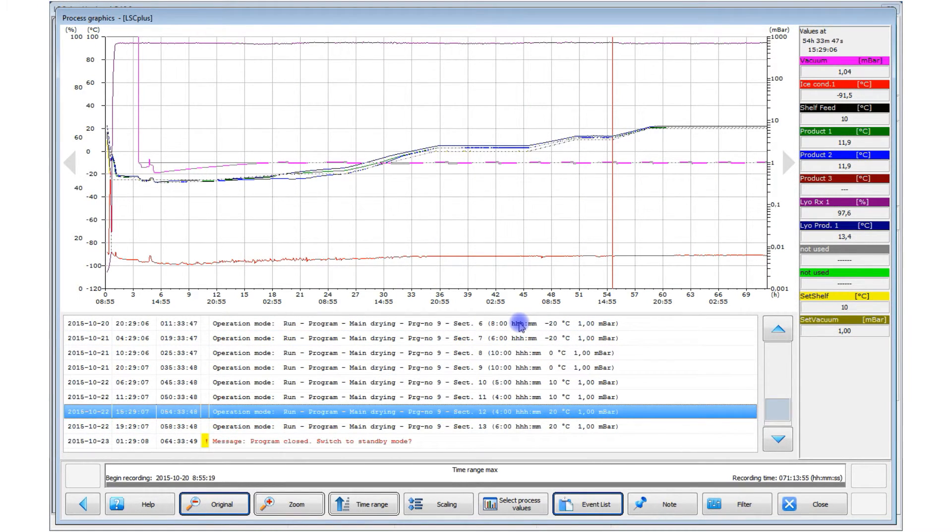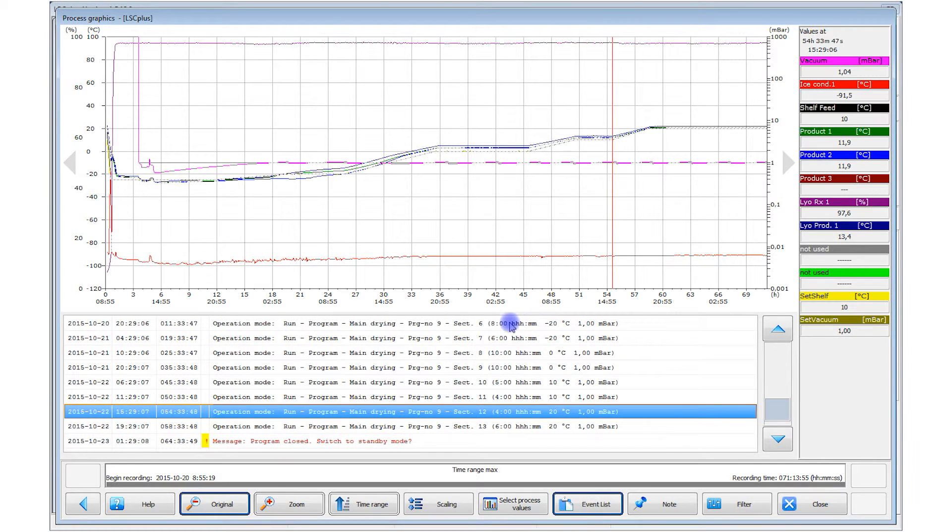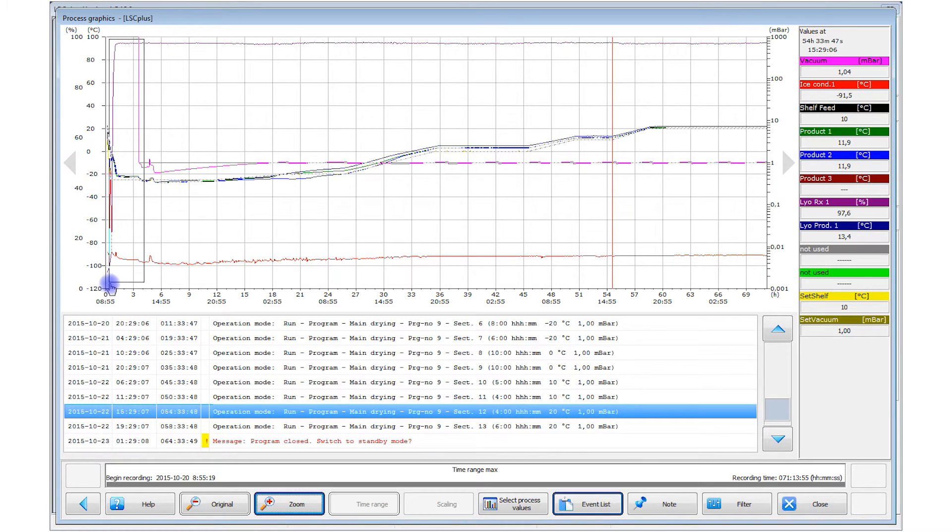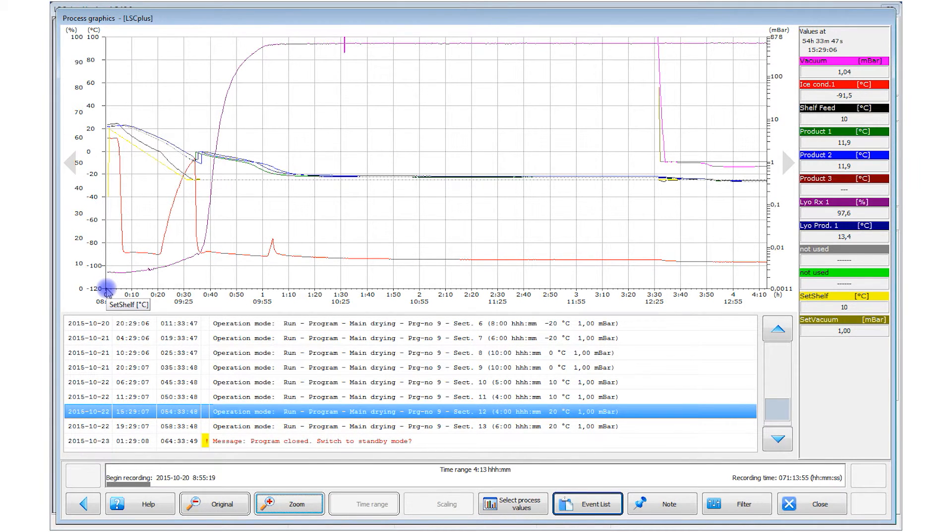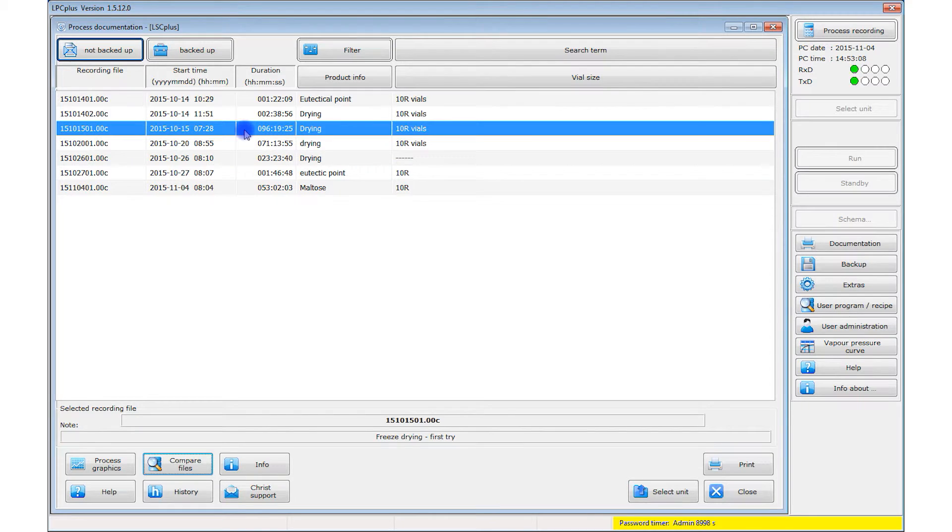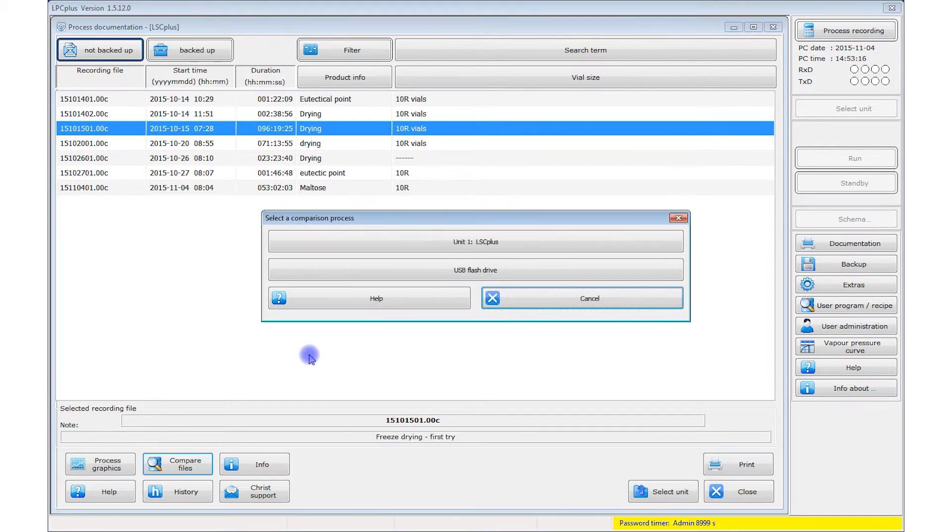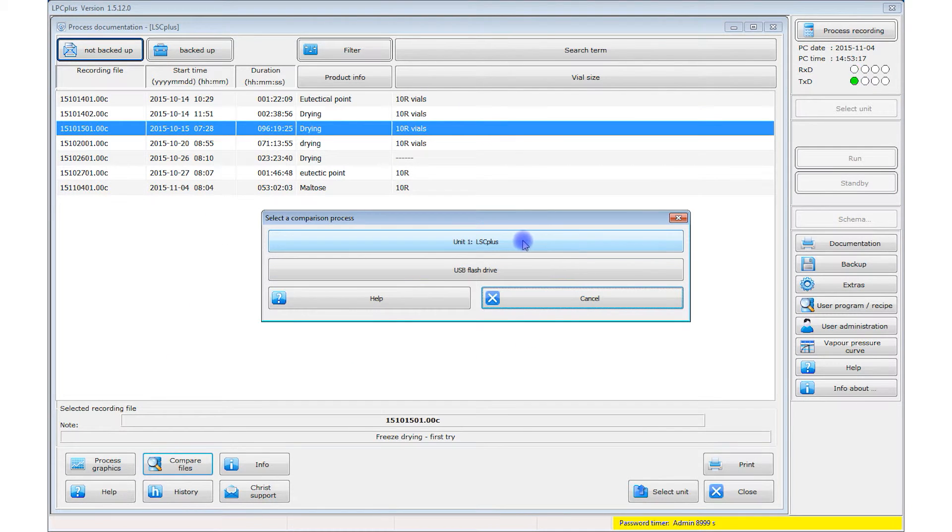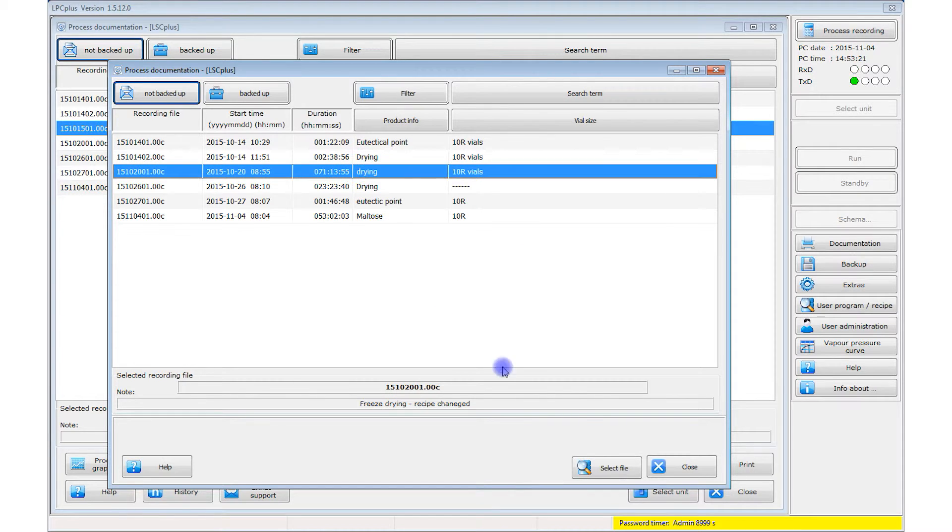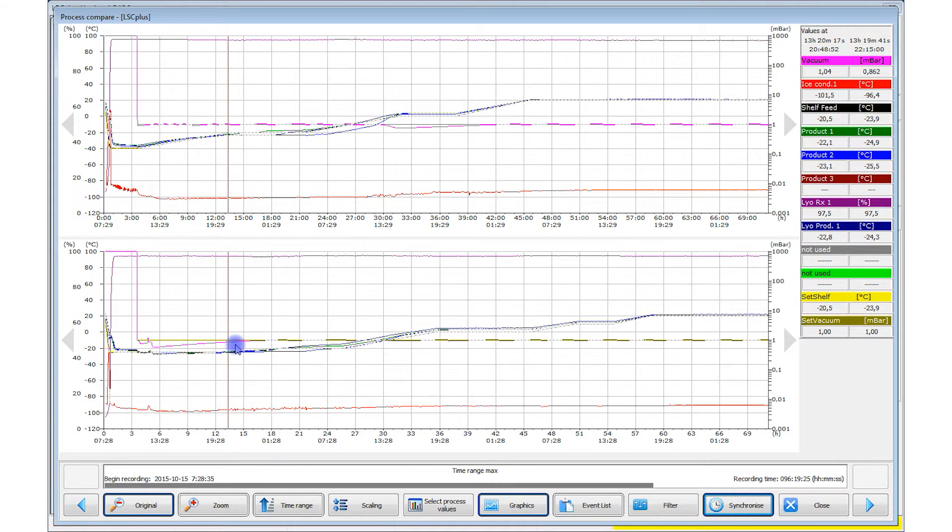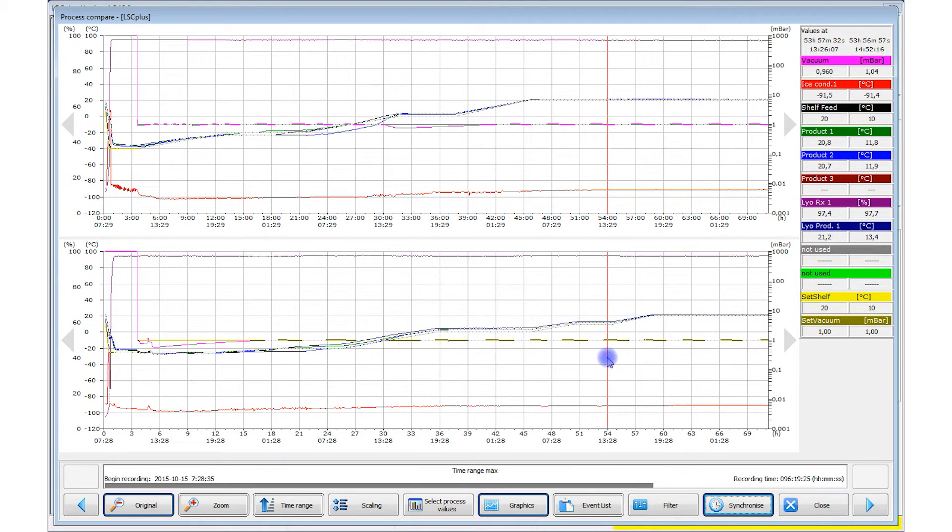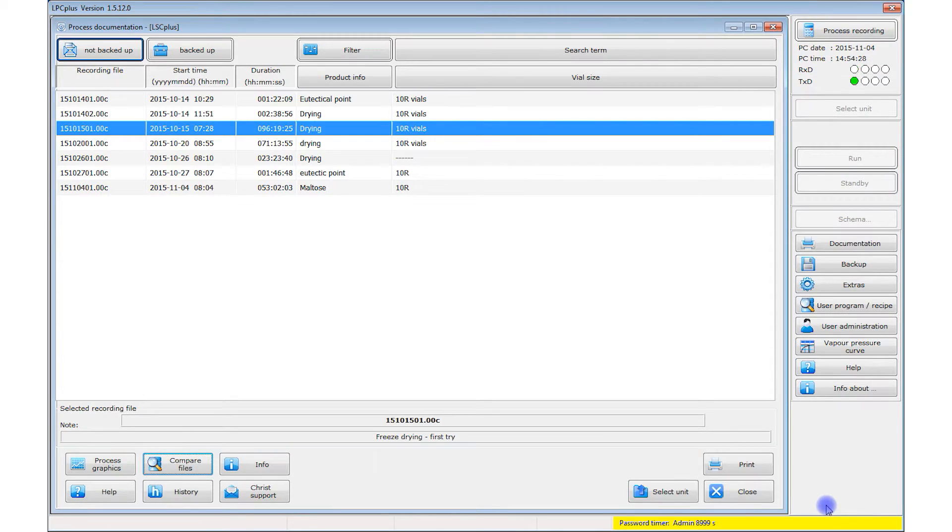You can use the zoom function to view a specific time window in more detail. For example, here we enlarged a portion of the record during the freezing phase. Another feature is comparing different processes in overlay view. To do this, simply select a second process from the library and both processes are shown overlaid. You can also synchronize the two processes, which makes process comparison a lot easier.